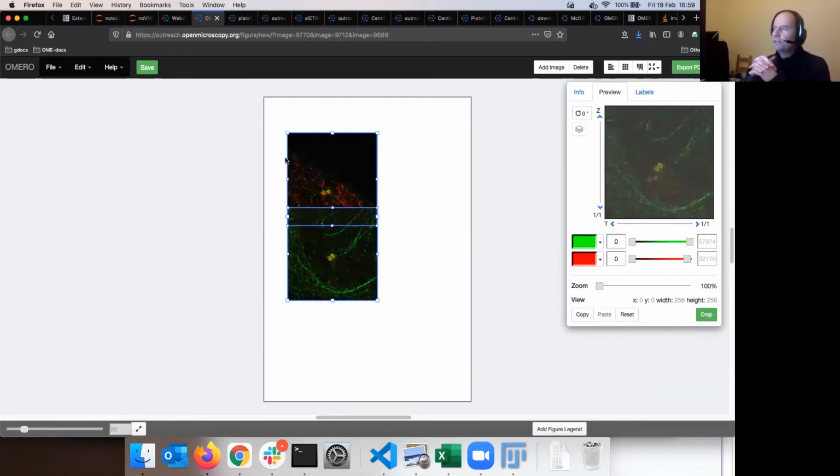The idea is that OMERO.figure is basically fetching on the fly the metadata from OMERO, and it remembers which images are inside those panels. So this is not some copying of data, it's just basically a connection between OMERO and OMERO.figure, where it's remembered who is who inside each panel, and the metadata, which we were belaboring enough during those 2 days, are being always asked and fetched and used by OMERO.figure to display them on the panels in the canvas.